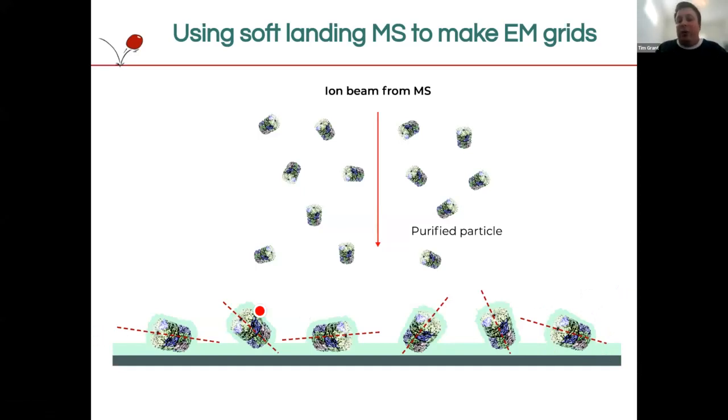And so this is our ultimate aim, and I think this would have amazingly good contrast, and quite possibly would not suffer from things like beam-induced motion, and maybe you'll get better orientations. This is something that we have not done. Unfortunately, I'm not going to tell you that we've done this today, but it's something that we're very much working on.